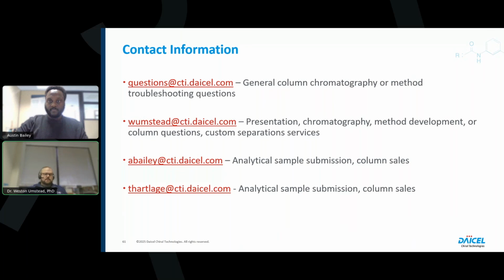If you want to just stay with ODH, I would encourage you to look at our method development guide. There's a number of screening protocols that are in there. If you just want to stick with ODH, you can manipulate the mobile phase landscape around what OD is compatible with. You might find that going from SFC mode to normal phase mode, or normal phase mode to polar organic mode, allows for a separation on ODH. But again, it's still an unpredictable modification of mobile phase to hopefully extract some sort of a separation.